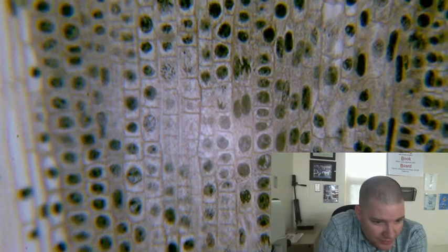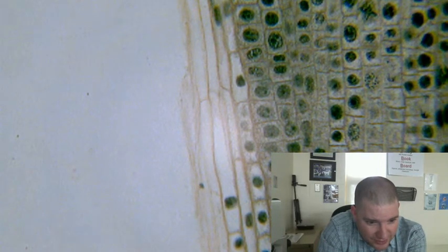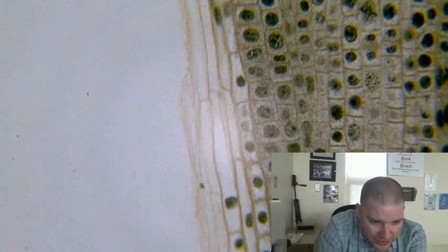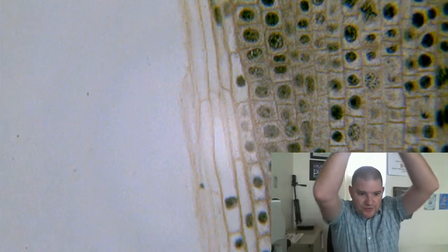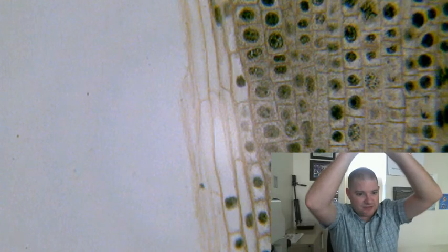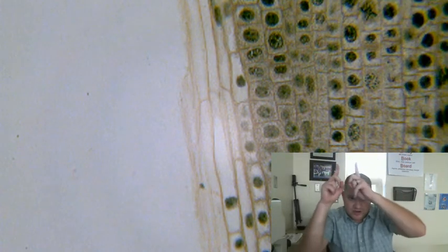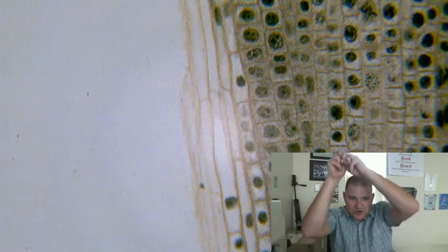We've got some prophase happening over here, kind of right above my head, right smack dab in the middle. You got some prophase because you can see that it's kind of broken up to where you can see the middle part of it. All the way at the top, if you go directly above me and follow my fingers right there, about that one, that would be prophase because you can see it's kind of dissolved the nucleus. It's not a full intact circle. Like the ones over here are more fully intact. That would be just a normal interphase cell.